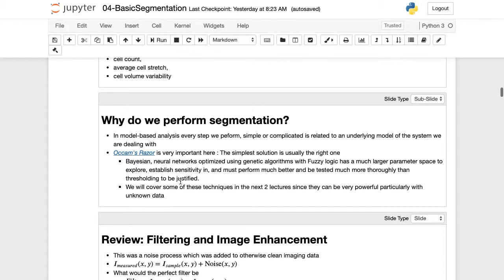And so often you'll see papers where they do really complicated things. One of the examples that we've seen is that they're trying to segment tumors in brains, and you look at the image, and the tumor's a bright white spot. And they train a special type of very complicated neural network to try to automatically segment these tumors. And in fact, if you looked at the image and just said you keep all the points that are brighter than 120, you would have a much better model for the tumor, and you wouldn't have a really complicated system you were trying to understand.